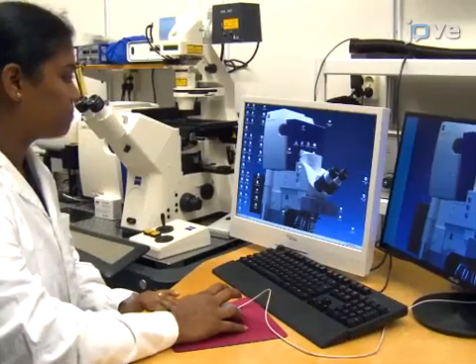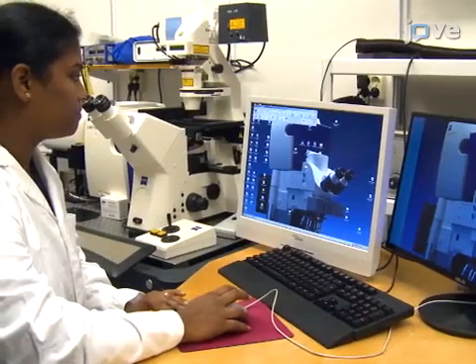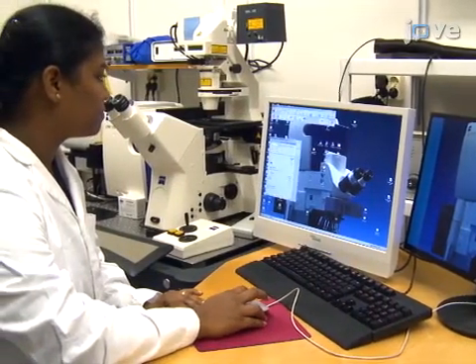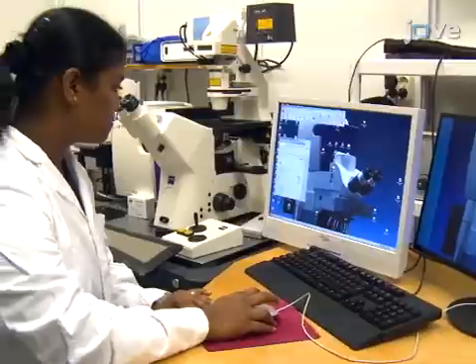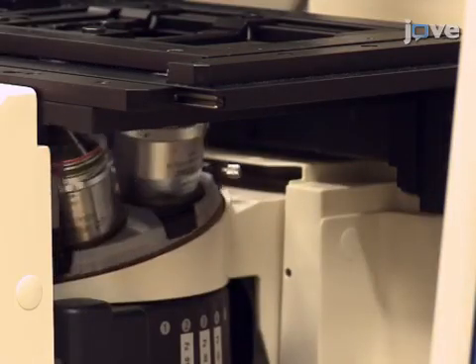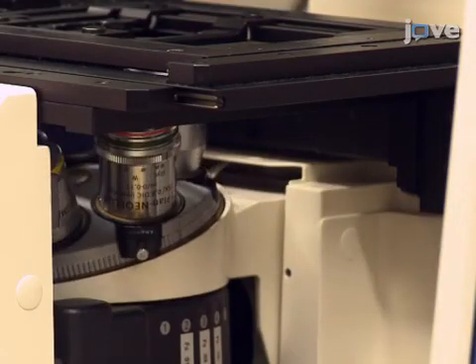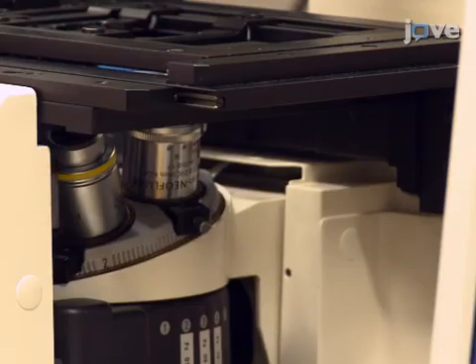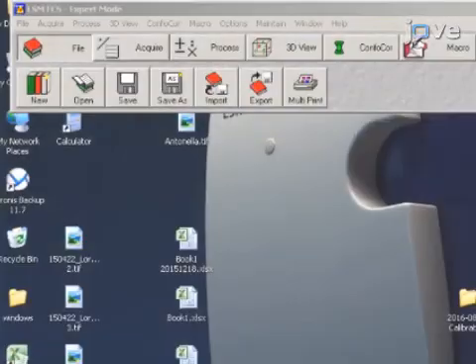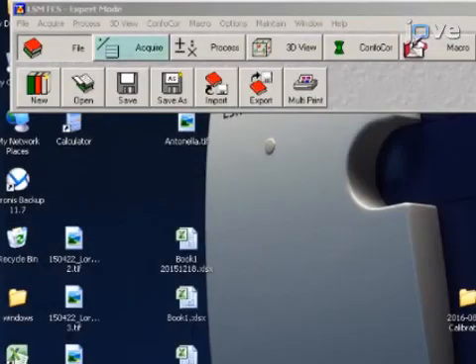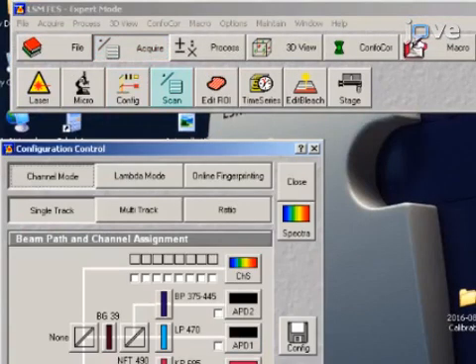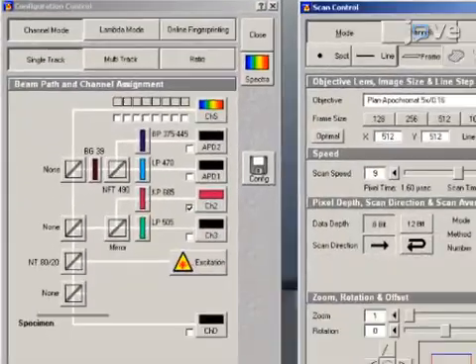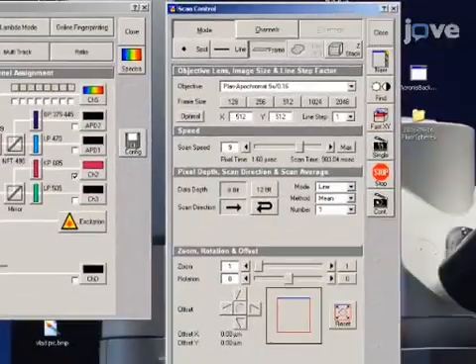Open the software in expert mode with the option scan new images selected. Select the 40x water objective lens on the confocal laser scanning microscope. Under the Acquire tab, press the Config and Scan buttons to open the Configuration control and the Scan control.